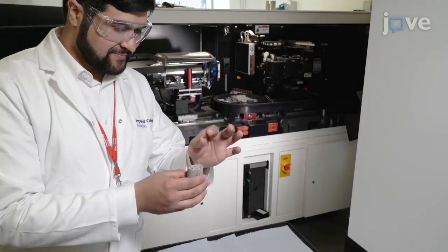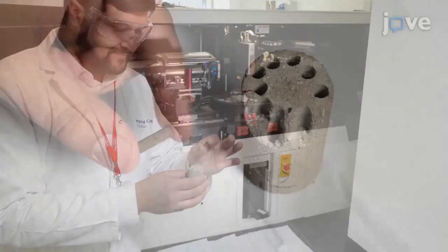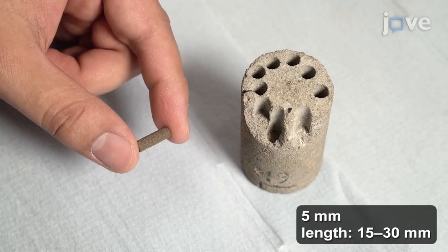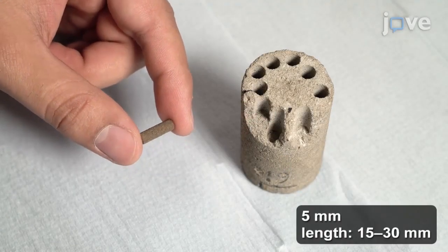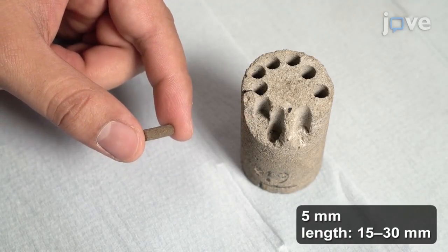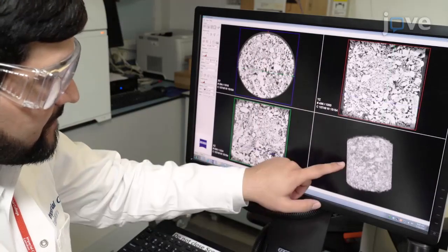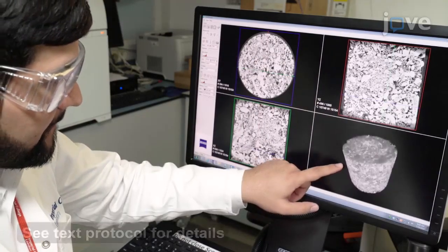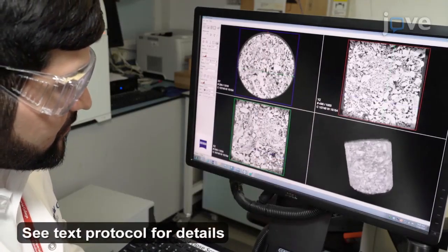The protocol requires a mini-sample of rock. Obtain mini-samples from coarse samples and flatten each end to facilitate good contact. Determine the sample's total porosity and assess its internal pore structure.